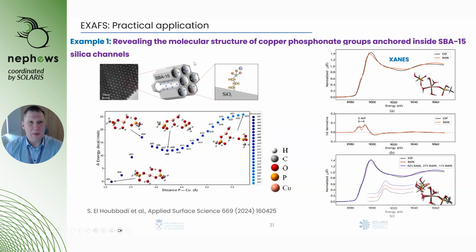Okay, let's go now to the practical application of EXAFS. For example, we would like to investigate the molecular structure of copper phosphonate groups anchored inside mesoporous silica channels, as it is presented in the scheme. Using XANES spectra, we could investigate what was the geometry of the molecules, and modeling of different geometries and applying linear combination fitting allows us to understand that it could be 3 different geometries of the molecules.